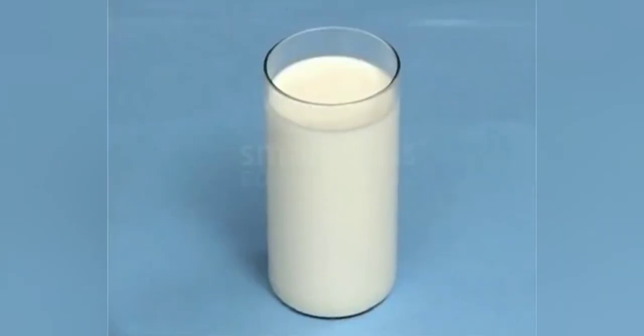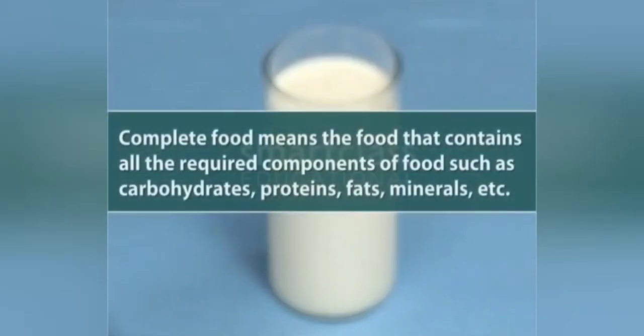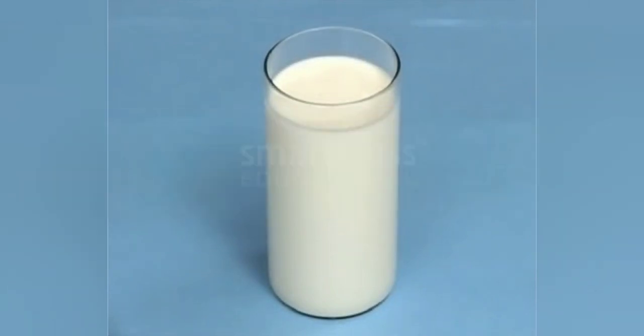One should have milk in his diet because it is a complete food. But what is meant by complete food? Complete food means the food that contains all the required components of food such as carbohydrates, proteins, fats, minerals, etc. Milk contains almost all of these required components, so it is a complete food. Let us conduct an activity to find out the presence of components of food such as starch, protein and fat in different food items.